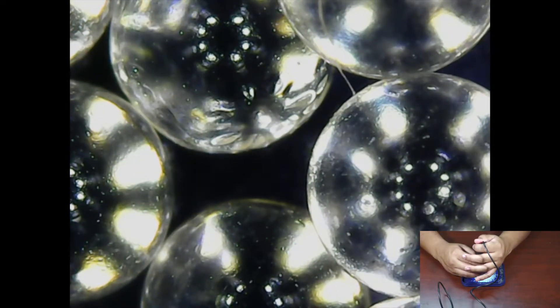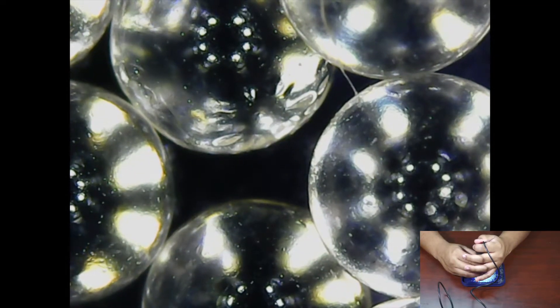Alright, here we got some Orbeez. They look kind of like diamonds. I'm not gonna lie, this is actually pretty cool — I thought they would look kind of lame. Let me try to focus on this one and zoom in all the way close. Okay, I think this is the closest I'll be able to get. They look kind of like diamonds — from far away and then you zoom in, they still look like diamonds.